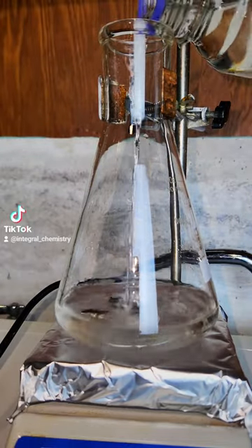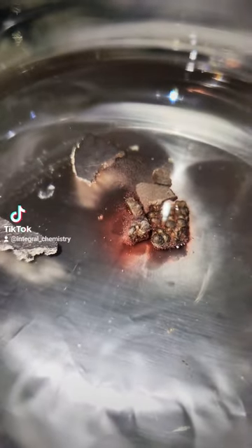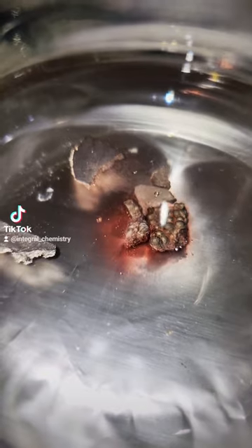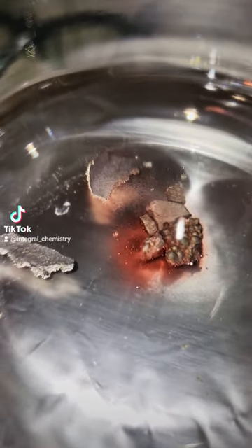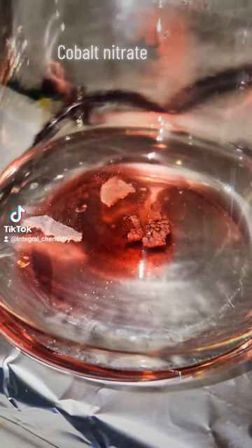To dissolve the cobalt, I make a dilute nitric acid solution by adding a little bit of nitric acid to a lot of water. As the cobalt begins to dissolve, you can see a vivid red cobalt nitrate begin to form in the solution.